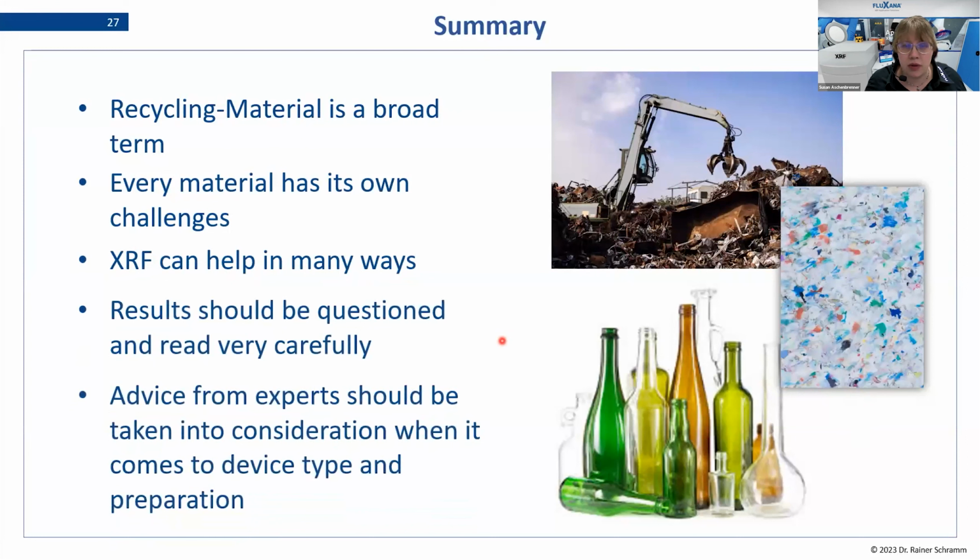And what is also very important is that if you're very new to this field, the advice from experts should be taken into consideration when it comes to buying a device type and deciding on preparation technique, because the device type and also the preparation have a major influence on whether the measurement and the evaluation of the results is working in the end as intended or not.